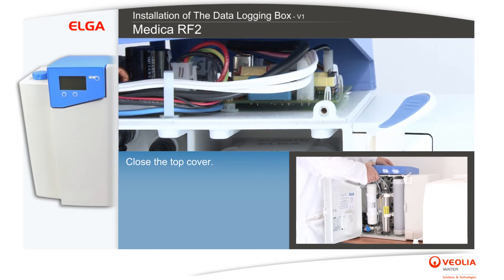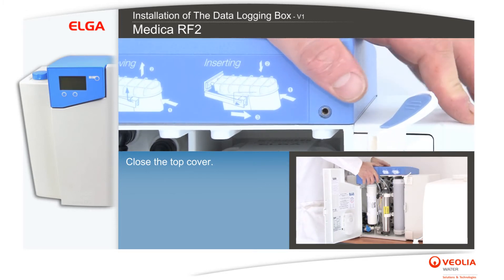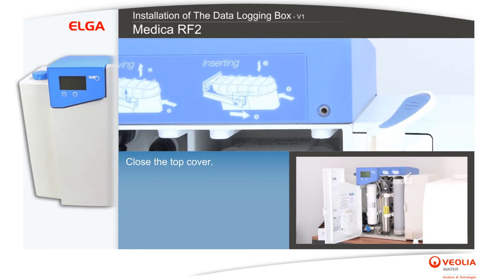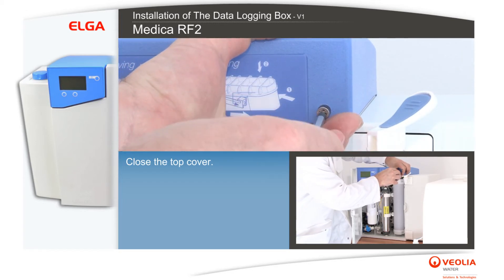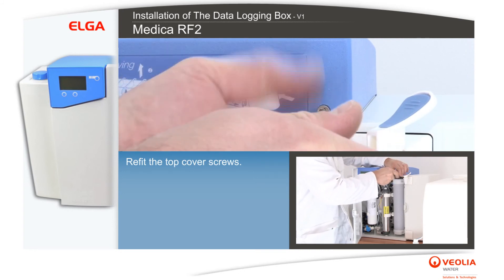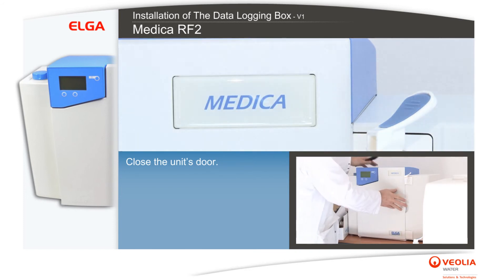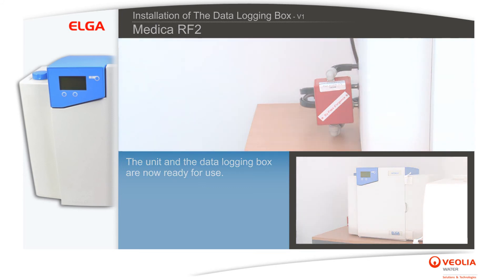Close the top cover and refit the top cover screws. Close the unit's door and remove the installation kit packaging. The unit and the data logging box are now ready for use.